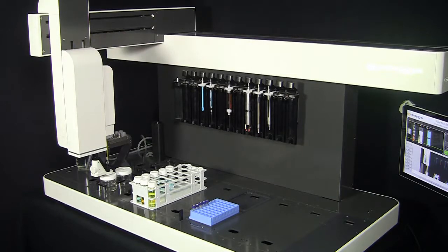And then the last task in the workflow for vial 3 is the solution is made up to 1 ml volume.